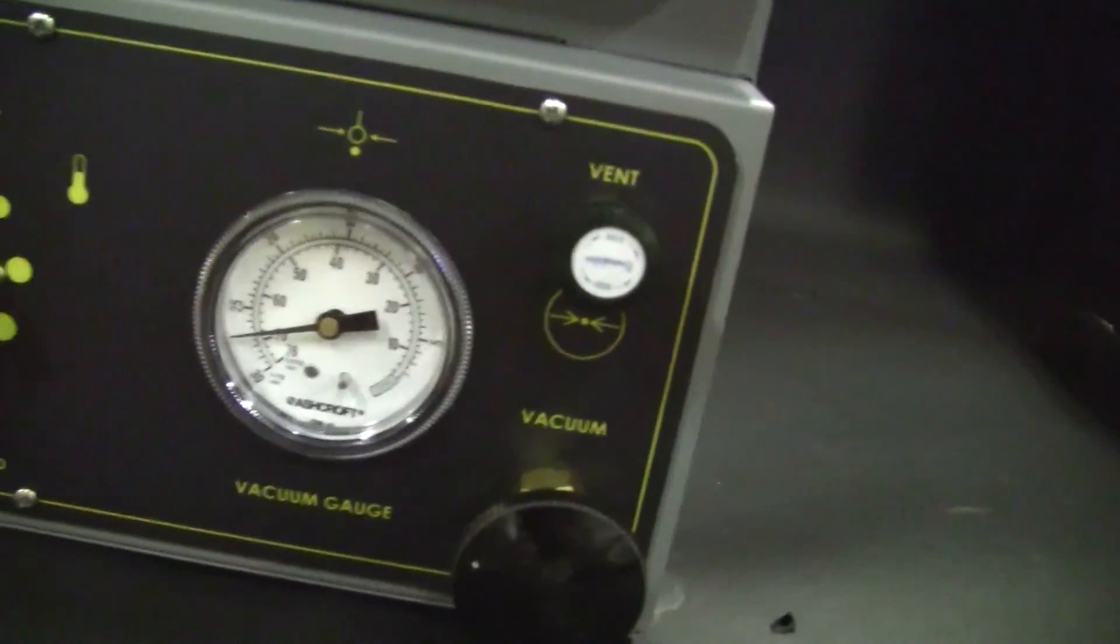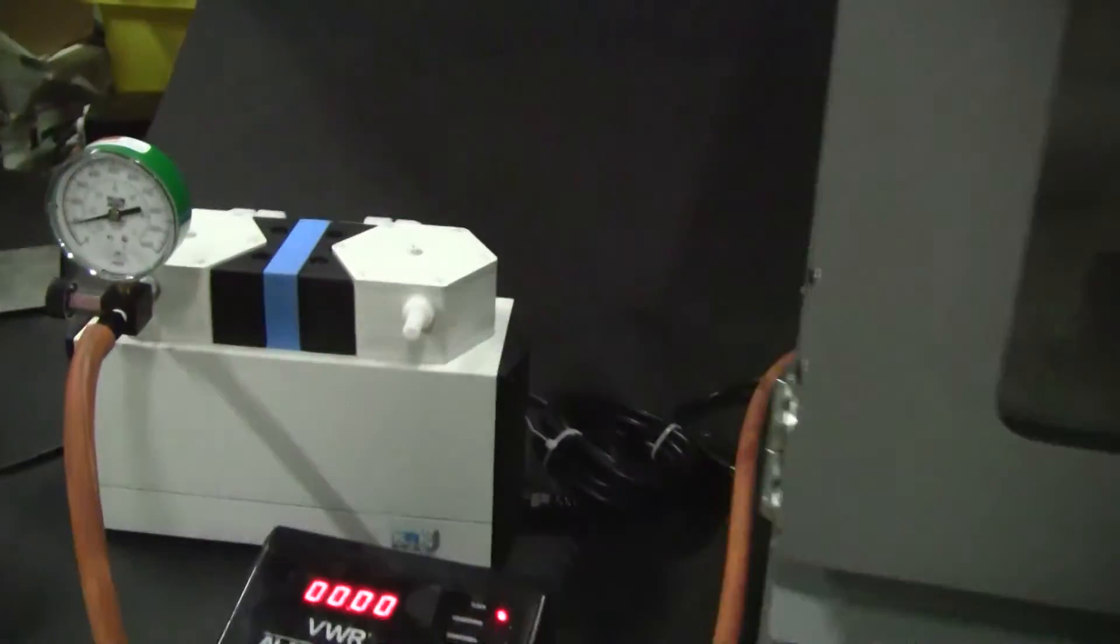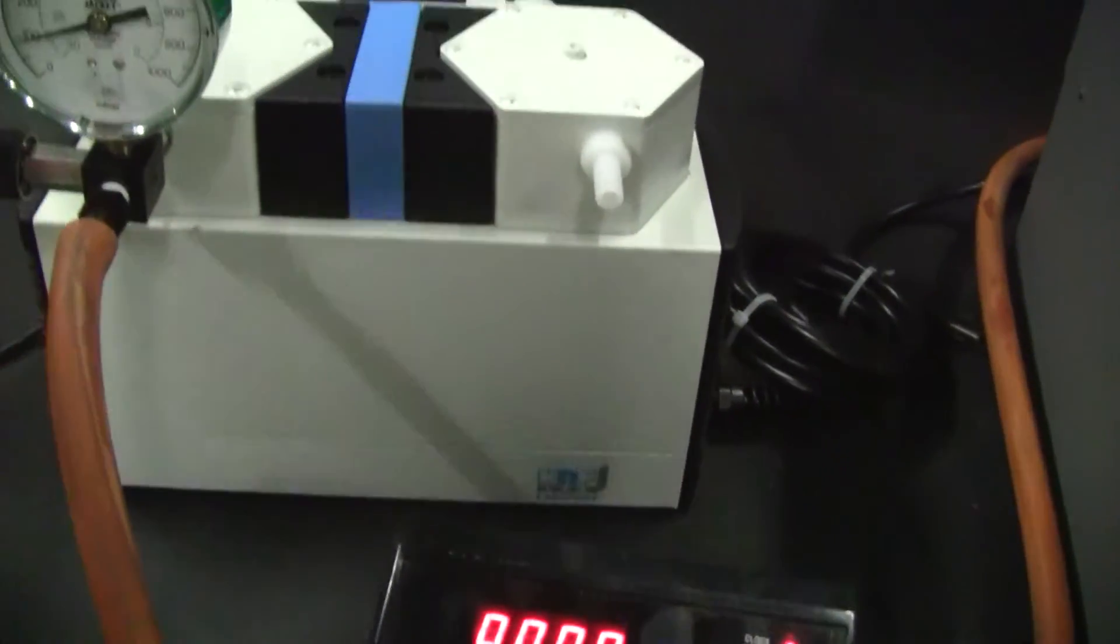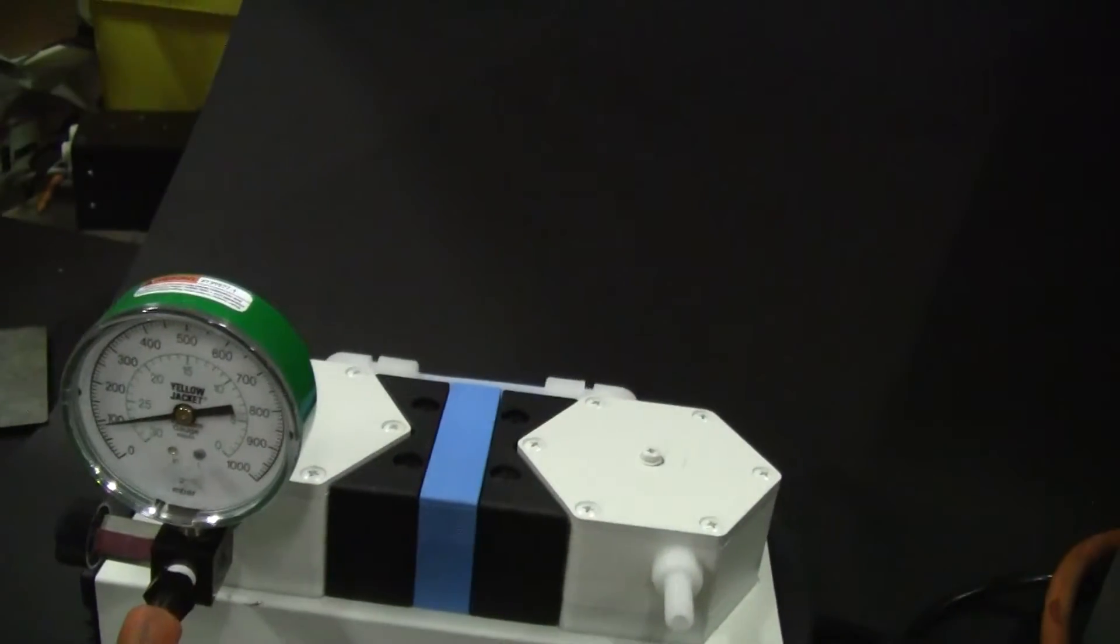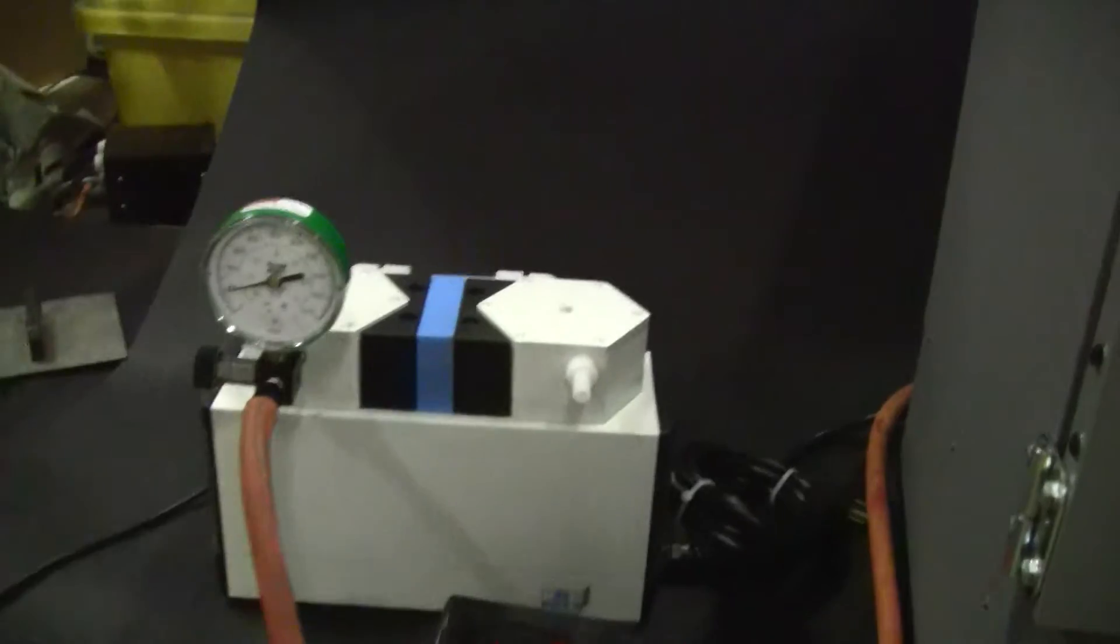We've hooked it up to a K&F pump, a lab port K&F pump. This particular pump pumps down to just about 8 millibar, and it's got a little gauge package on it which is quite convenient.